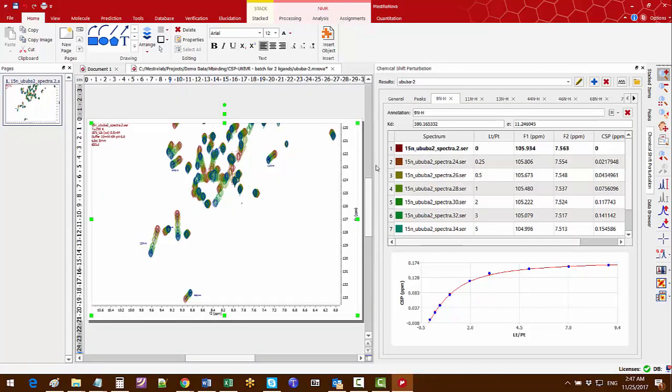I hope this gives you an idea about how to use Mnova Binding to do batch processing of multiple protein-ligand titration series. Hope you enjoyed it.